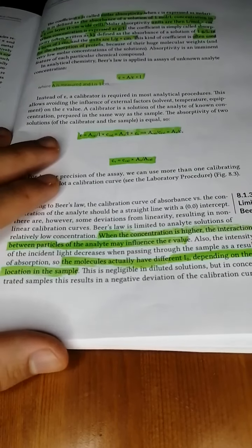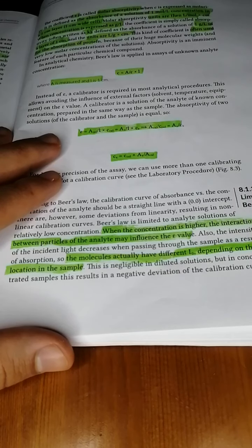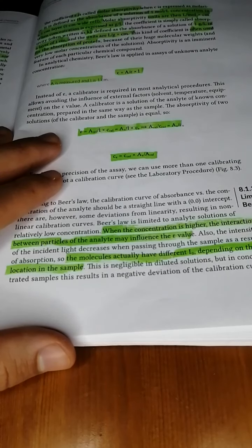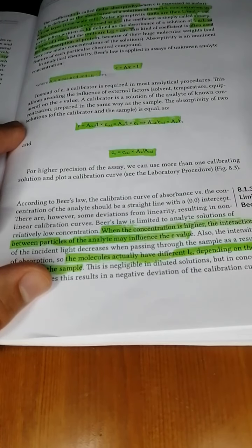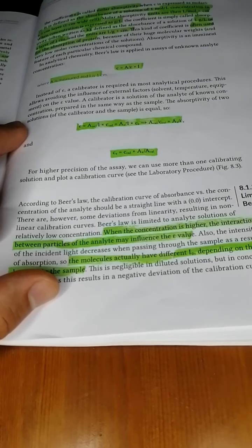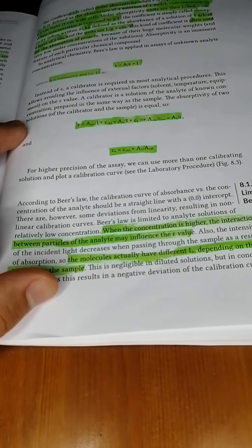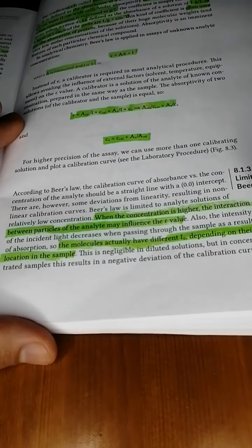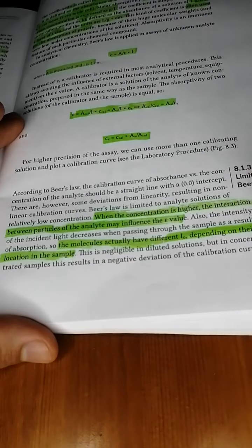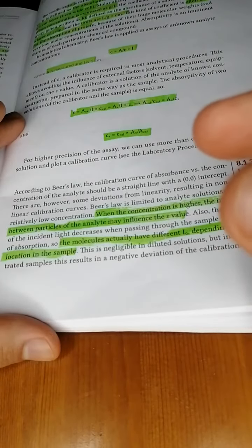One more thing. If you've been doing your practicals properly, you're going to notice that you also use a calibrating solution. What this calibrating solution is used for is to tell you the value for absorptivity, essentially. So if you don't have absorptivity and you want to figure out the concentration of a certain molecule in a solution, you're going to use a calibrator. So you're going to use a standard solution, meaning you know the concentration and you know the volume of it. So you're going to know the absorptivity, essentially.